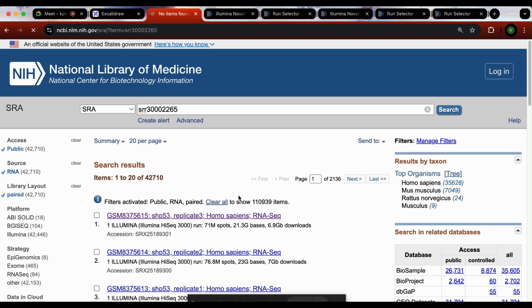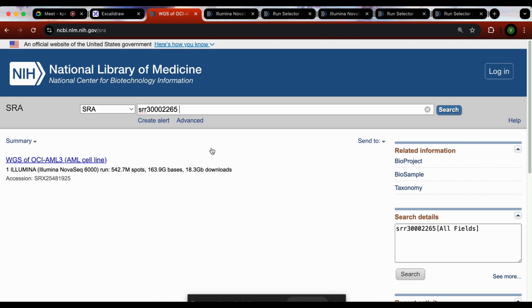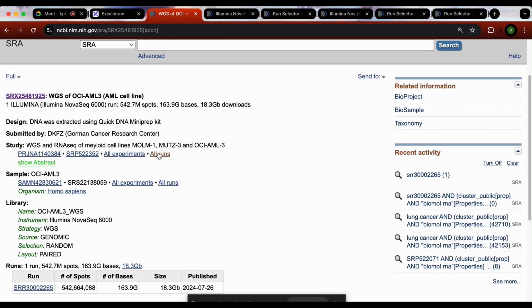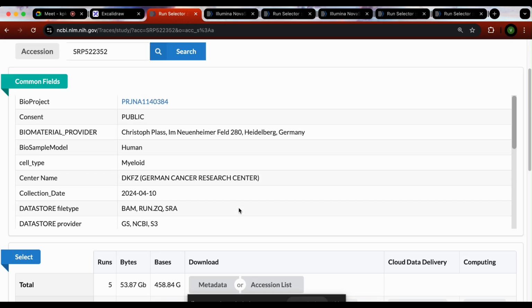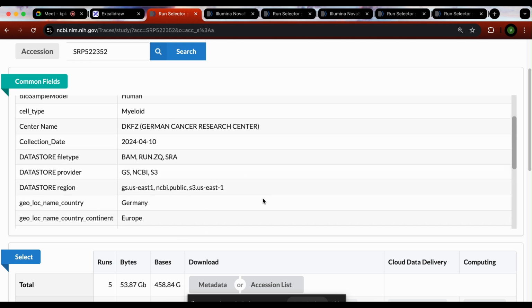So I've just selected, so this is the one which I'm interested in.